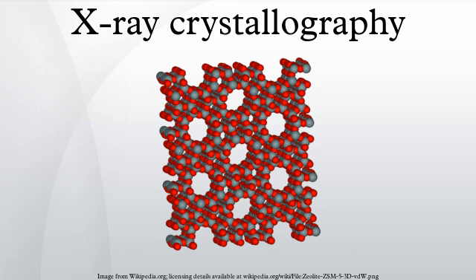Intuitive understanding by Bragg's law. An intuitive understanding of X-ray diffraction can be obtained from the Bragg model of diffraction. In this model, a given reflection is associated with a set of evenly spaced sheets running through the crystal, usually passing through the centers of the atoms of the crystal lattice. The orientation of a particular set of sheets is identified by its three Miller indices, and let their spacing be noted by d.